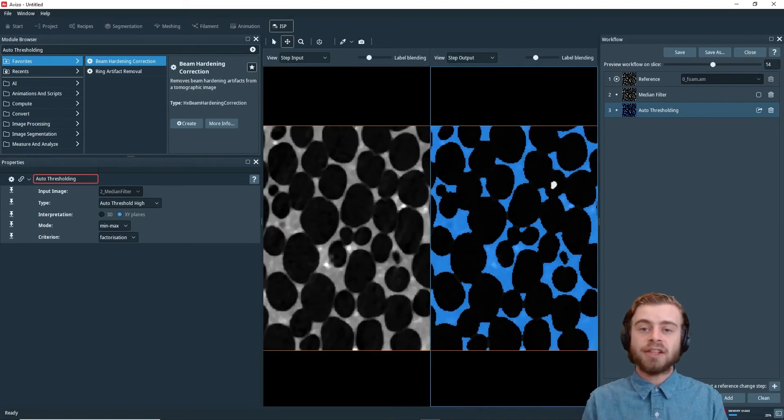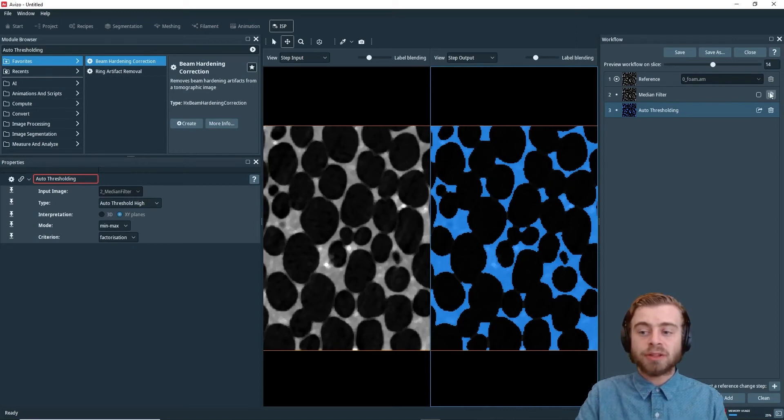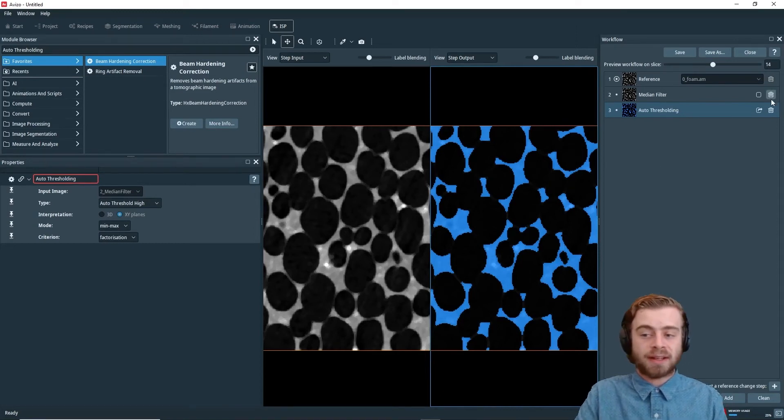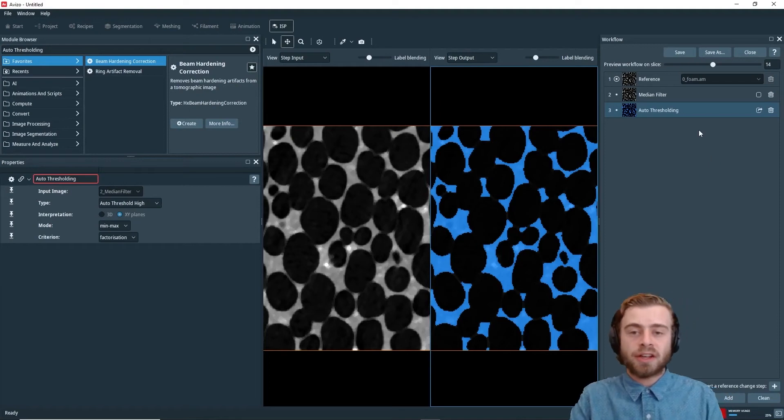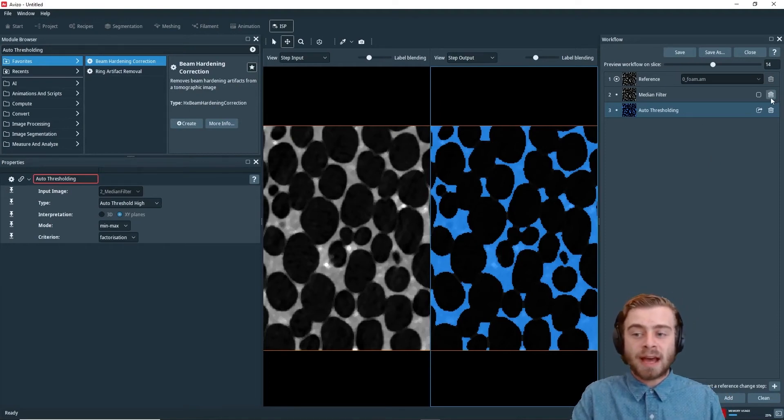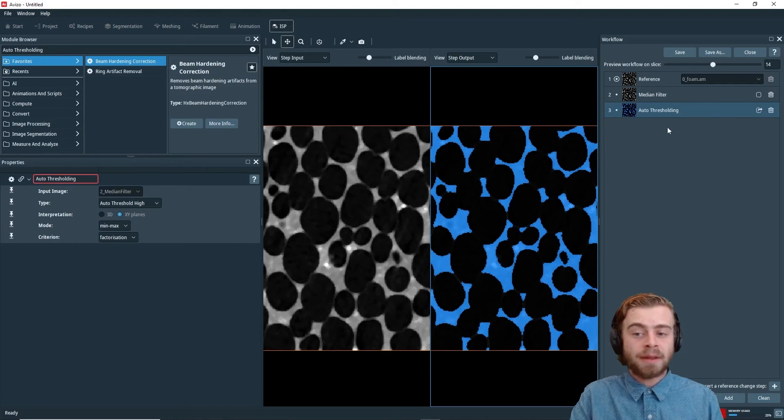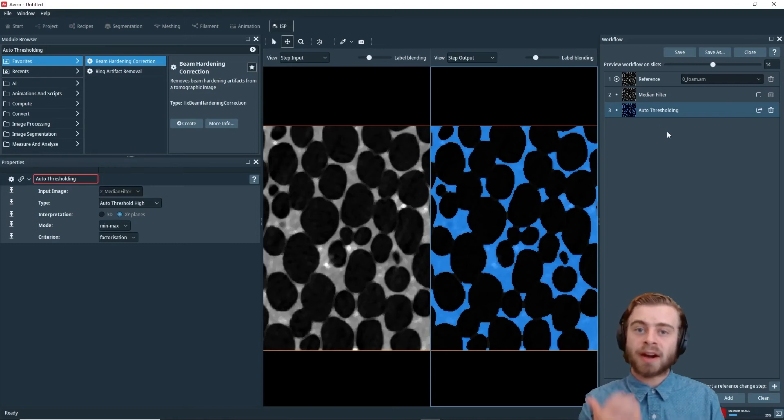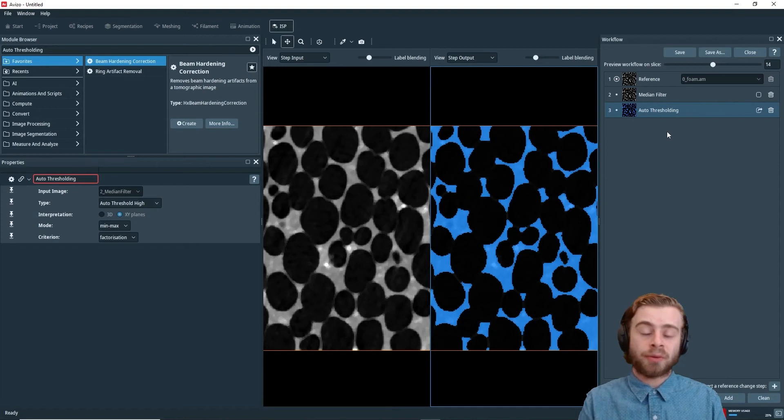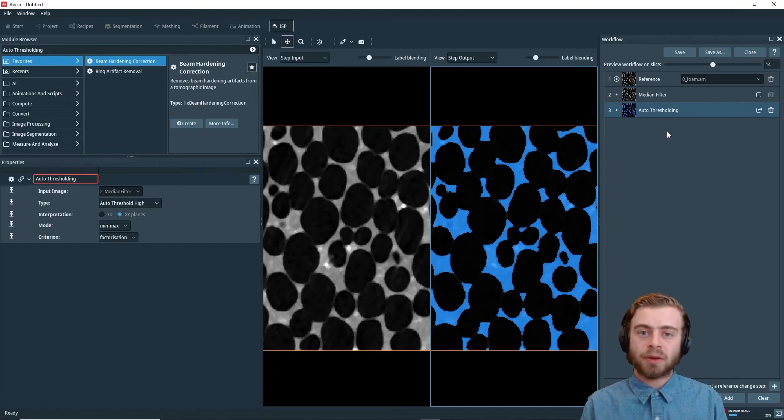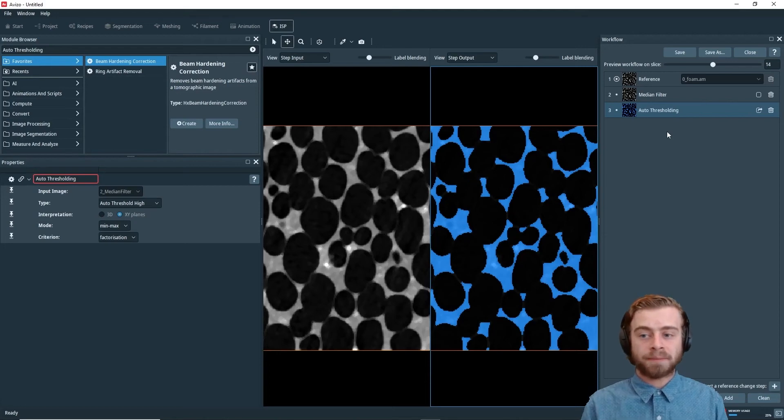So next, let's say you wanted to delete a step. To delete a step, you just click this trash can button right here. One thing to note, though, is if you delete a step that is a required input for the next step, let's say one of your steps requires a binary input and you delete the auto thresholding step, Avisa will give you a warning and ask you to fix it so you have a valid workflow.